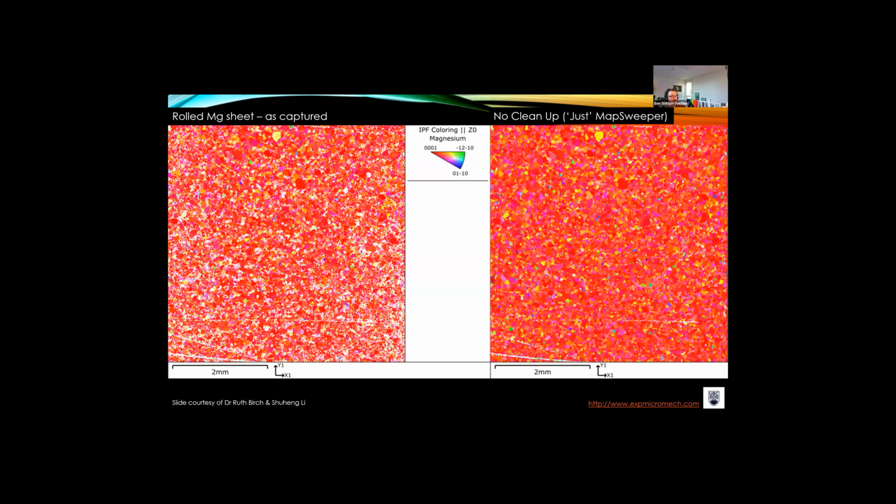So decrease the interaction volume size. That can be to reduce the voltage, play with the probe size, etc. But then the next thing, once you've got good focus as well, is to think, okay, how do I improve the diffraction pattern analysis to deal with effectively blurred patterns? And so that's where things like the pattern matching can get you out of that point.